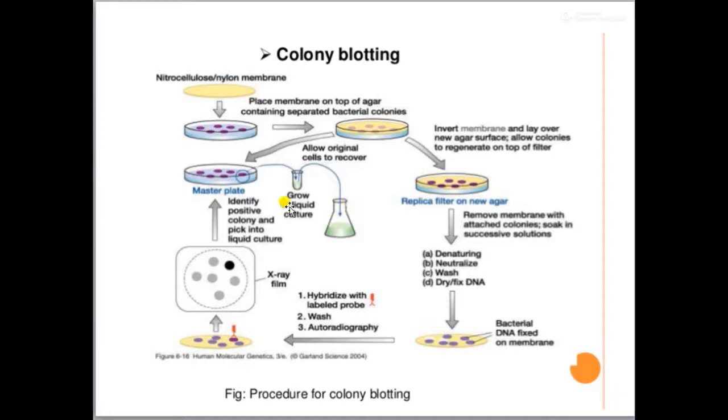And with the same technique, instead of X-ray films, other fluorescently labeled probes can also be used. I'm not going into the details of that because I guess this will be sufficient for you. Either you can use radioactively labeled probes or fluorescently labeled probes.